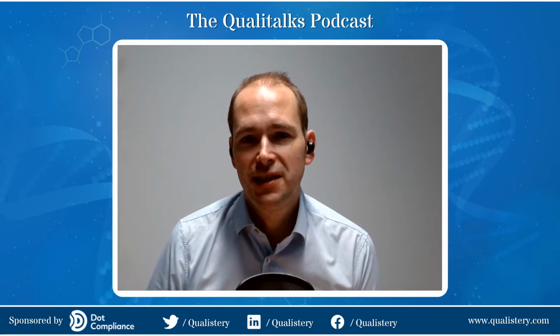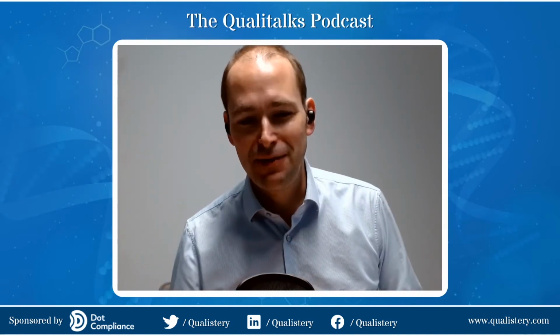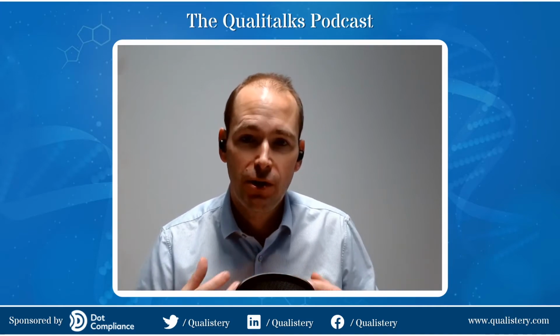Okay, and when you choose one, so there are two main types, but probably there are a lot of vendors. So what sets the vendors apart? Yeah, sure. Well, it really depends on what your process is. So I think, and this is quite a difficult thing to do with any facility, but you need to understand how you're going to be producing your product. What kind of equipment is the autoclave going to be used to process?